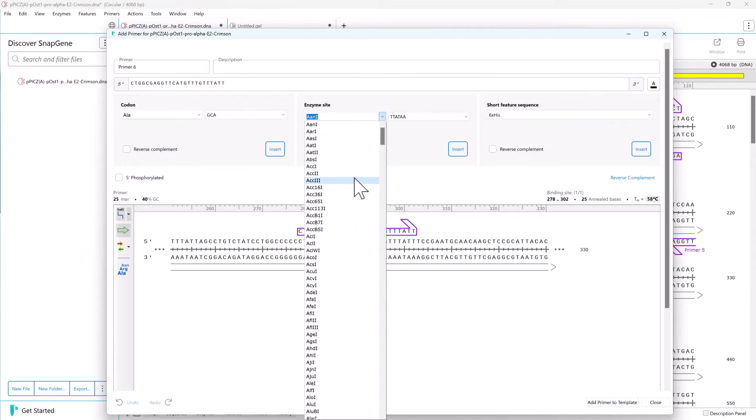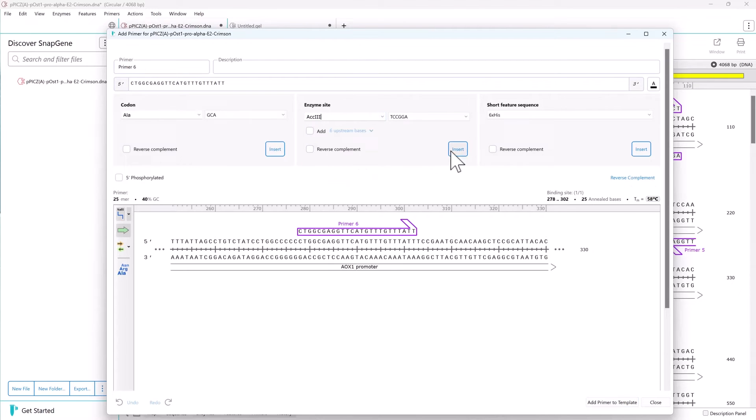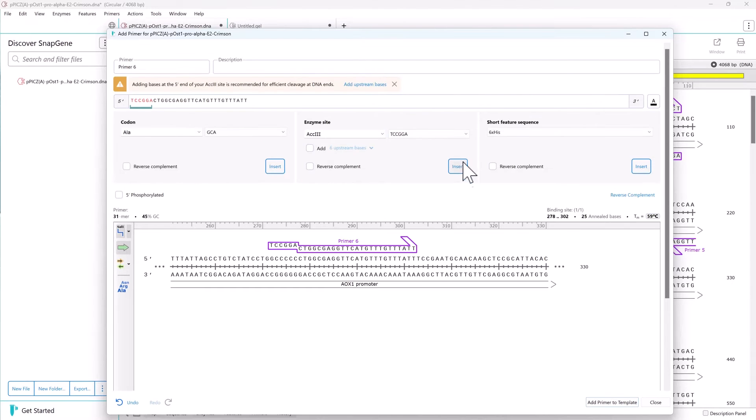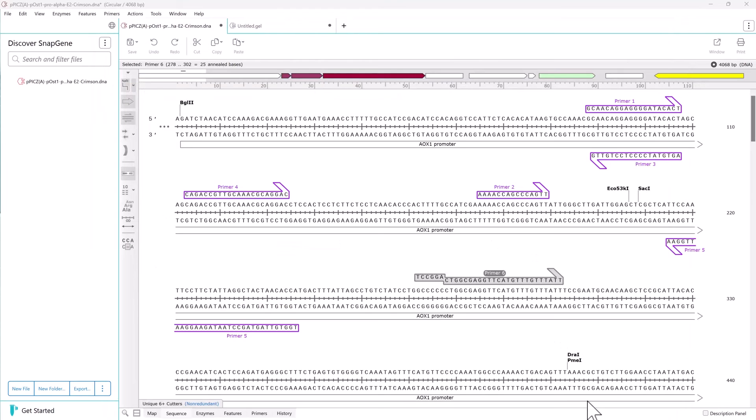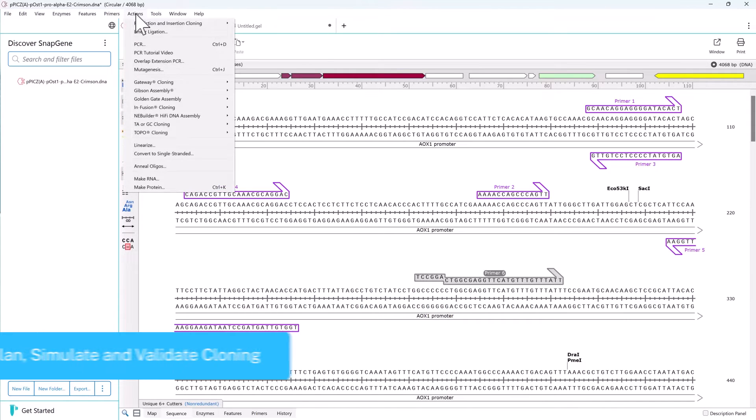SnapGene will automatically design appropriate primers for PCR in cloning experiments and assist with creating complex assemblies using one or many inserts.